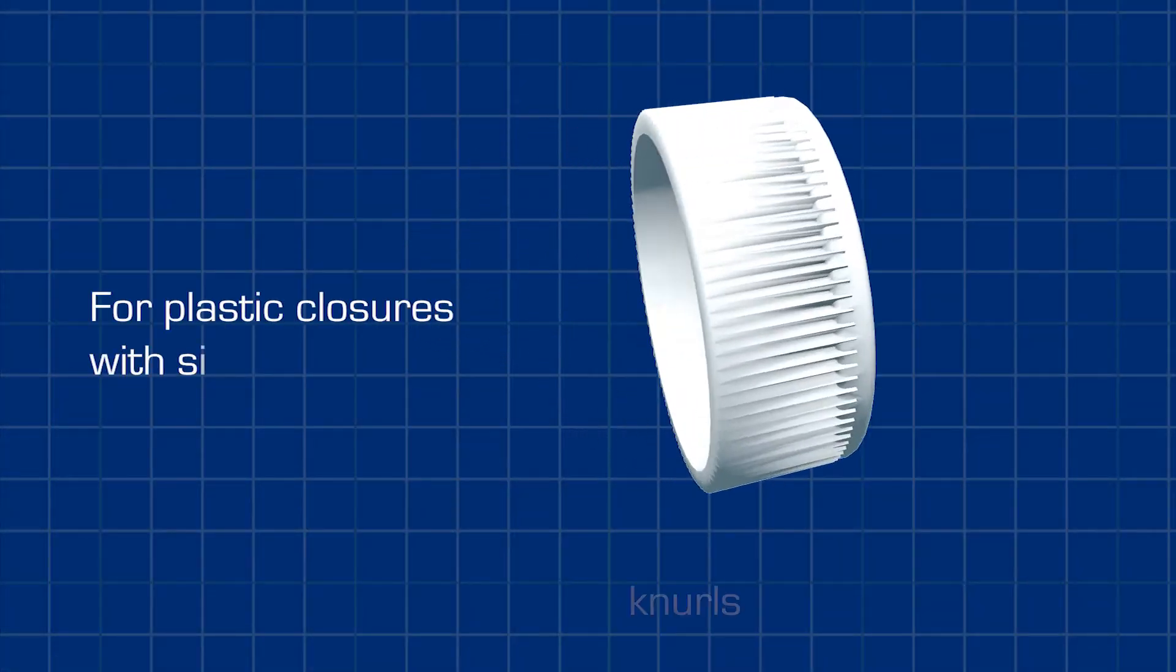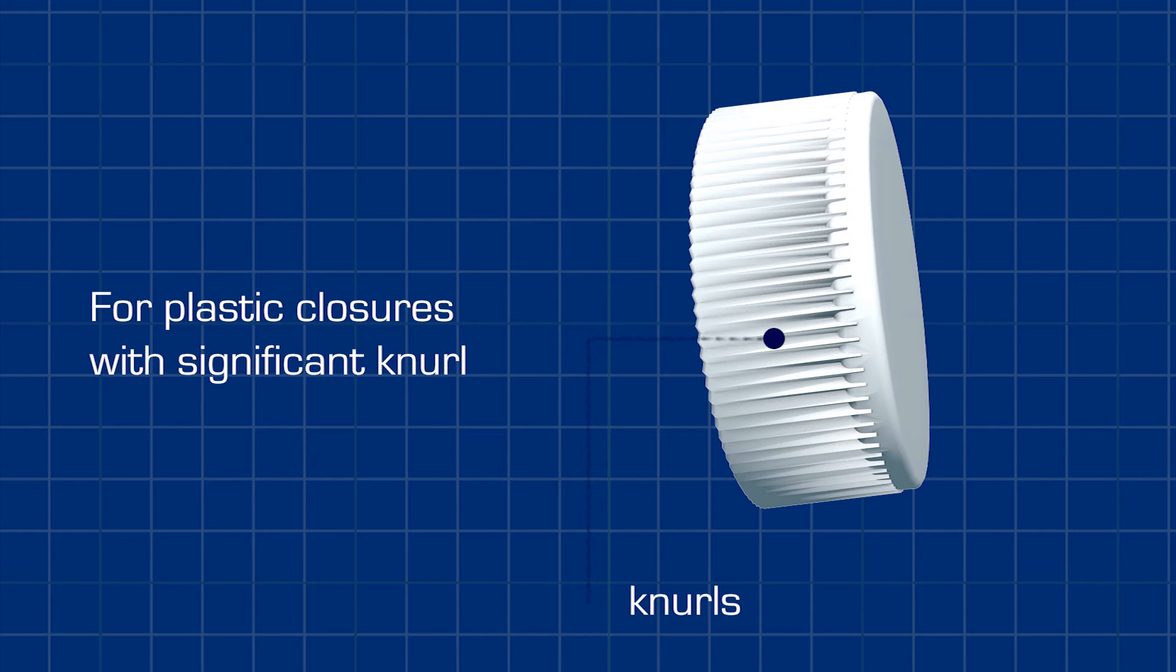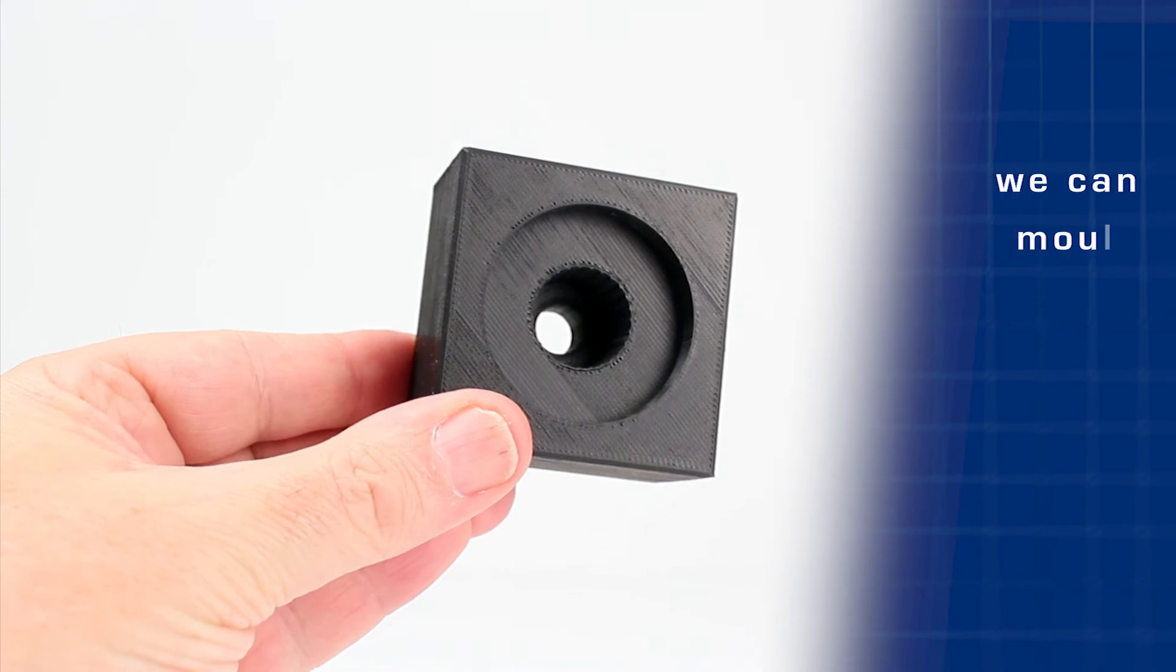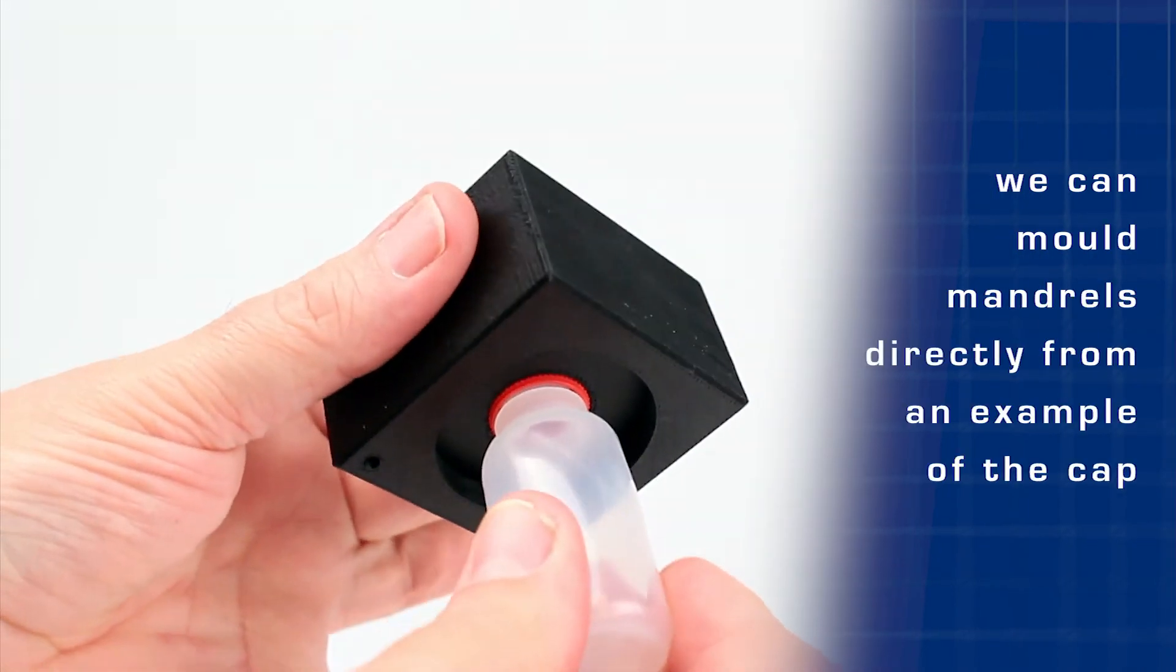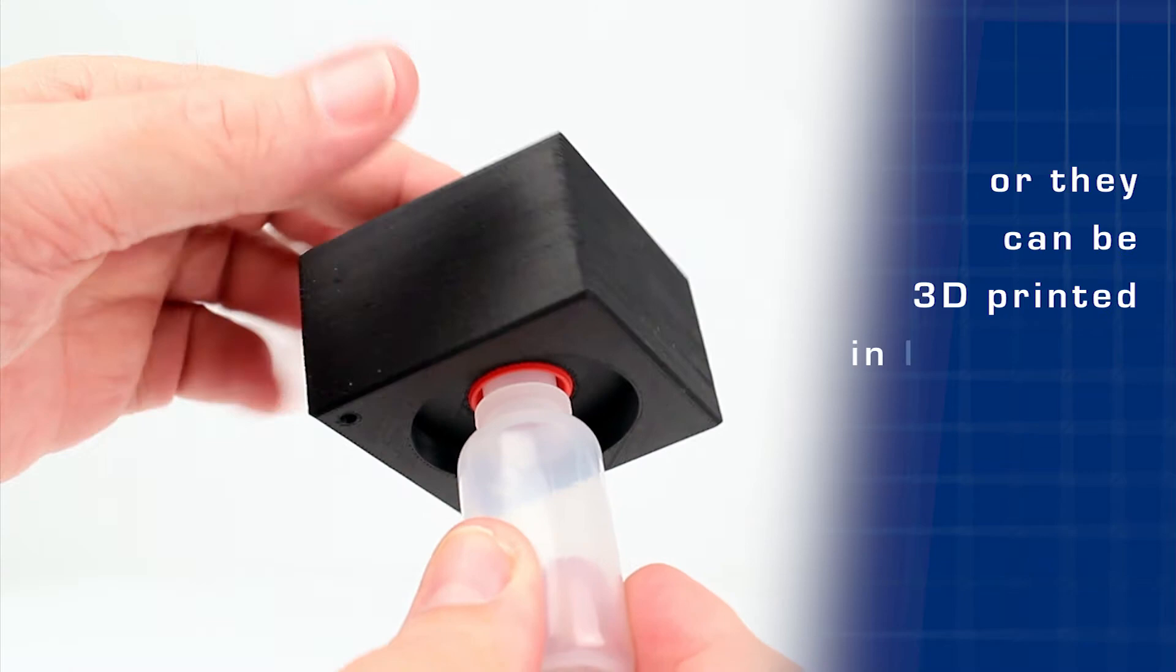For plastic closures with significant knurl, we can mold mandrels directly from an example of the cap, or they can be 3D printed in lightweight ABS.